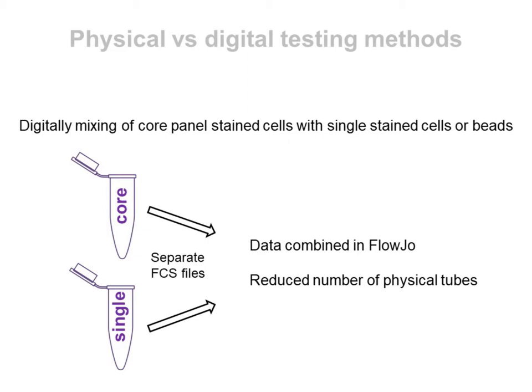We actually just need to collect one sample that is fully stained with the core panel, and I will present to you some of the panels we've tested, and the single stain with the CD45, 4, 19, and 127 in each of the empty colors. And I think this is probably a bit of a heavy experiment, although I think it's really affordable and feasible. But actually, it helps you really to cover the number of complications you may have if you run a complete set of flow analysis using all the detectors you have in your machine.